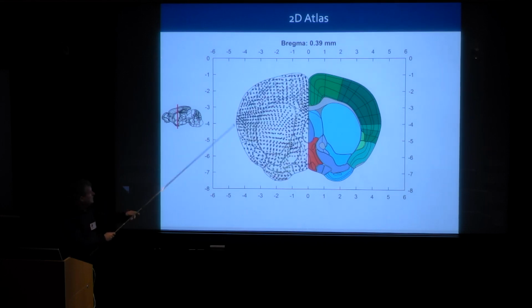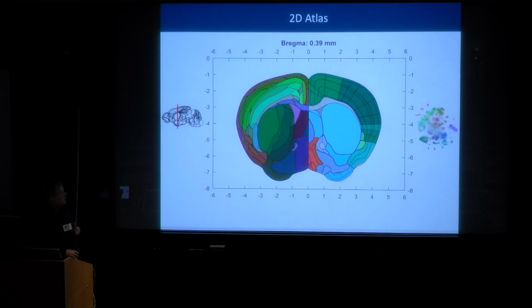So we have collected the data from this part, and it's hard to see, but we are connecting the different measurements by support vector machines to get these sheets that I just talked about. And this is the outcome from this section. And you could actually see that this histologically, morphologically non-informative region actually contains a number of new regions defined by gene expression.